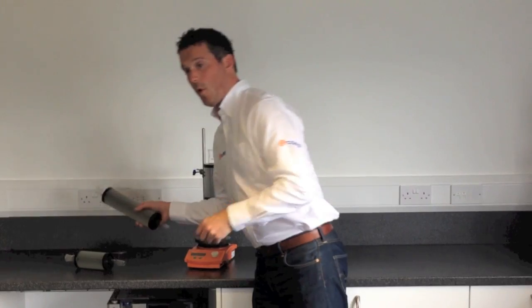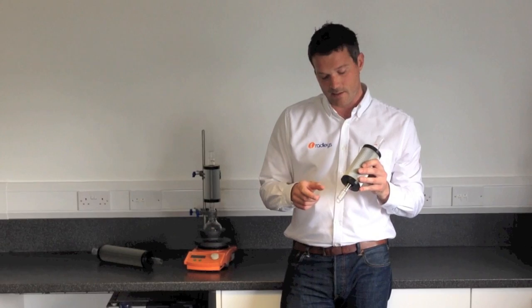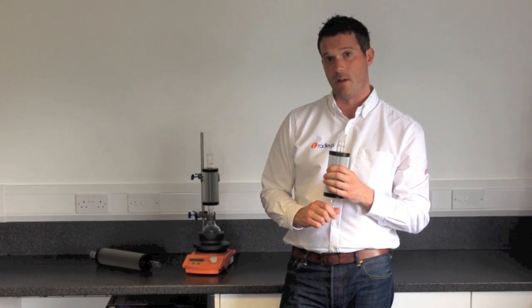And then we've got the Thindenser Mini. This is much smaller — it's 275mm long — and it comes in smaller joint sizes of B14, B19 and B24. This one is good for up to 250ml flasks with about 100ml of solvent in.